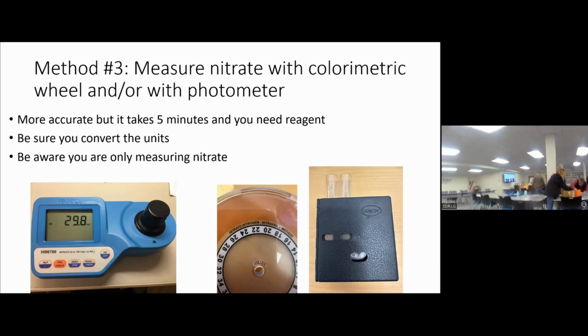Then you add the reagent. Shake it a little bit to blend it. Put it there again. You push read. And the instrument is gonna say, okay, you have to wait 4 minutes. It's gonna start the timer for nitrate, 4 minutes while the reagent reacts. Now you can handle it.